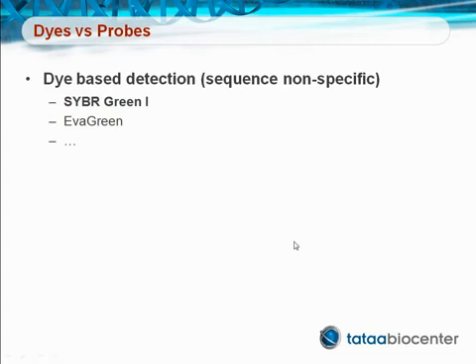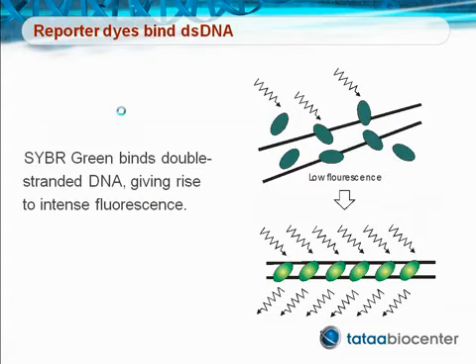The amount of product formed in the course of PCR can be monitored using a reporter dye, whose fluorescence increases upon binding to double-stranded DNA. Several dyes are available, the most popular being the asymmetric cyanine dye, SYBR Green I, originally developed at Molecular Probes. SYBR Green binds in the groove of double-stranded DNA. Upon binding, internal rearrangement of the dye is restrained, which leads to intense fluorescence.